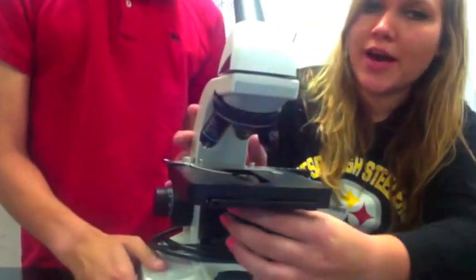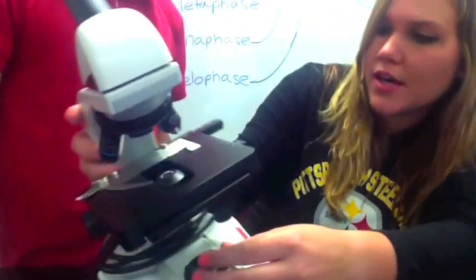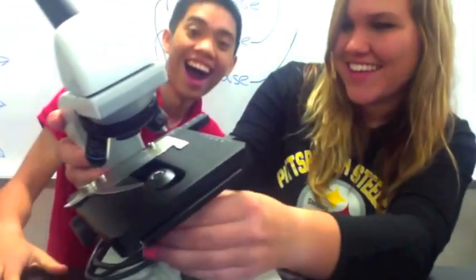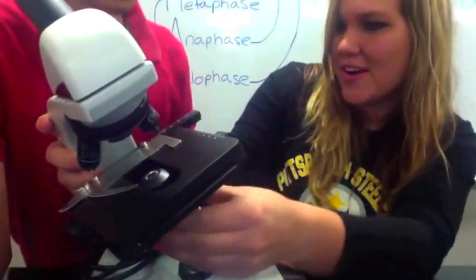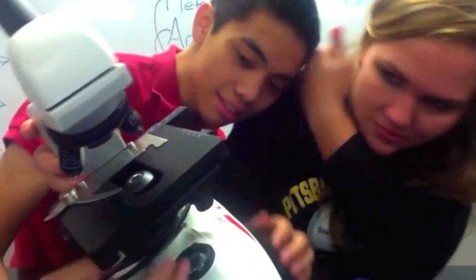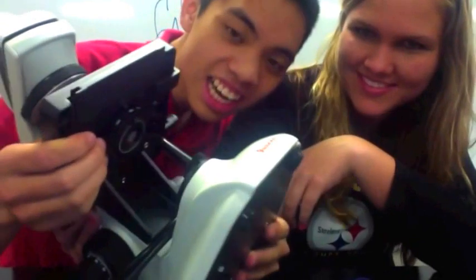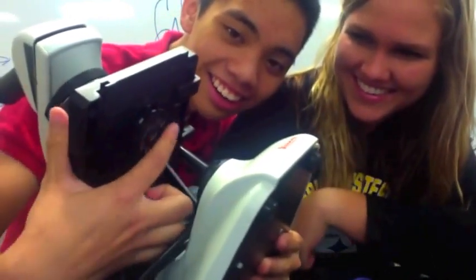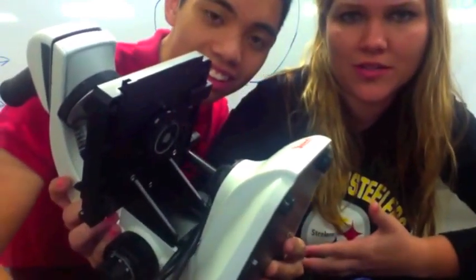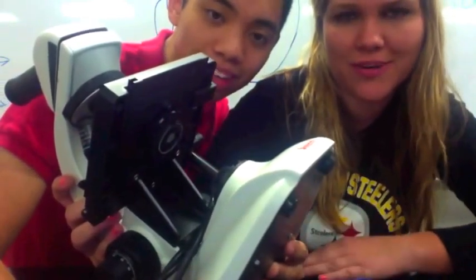The next part is called the condenser. The condenser is this component right here below the stage. It's another way to help you focus on your specimen so you can see it better.